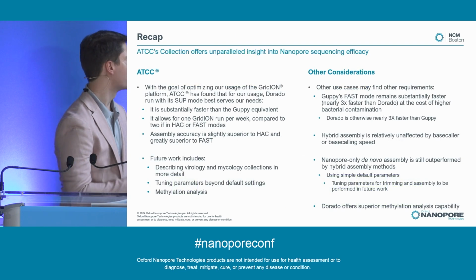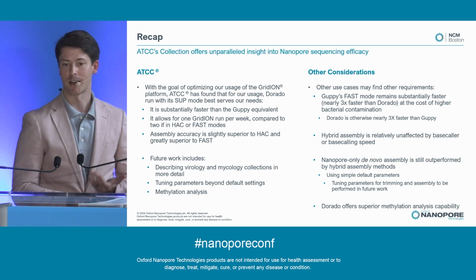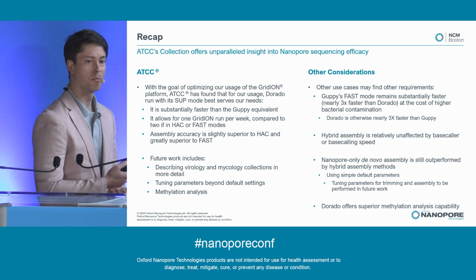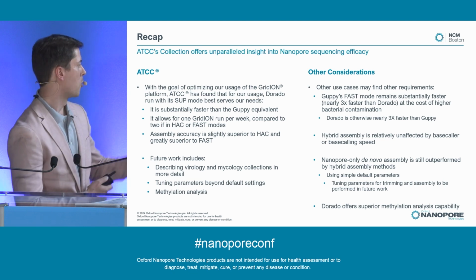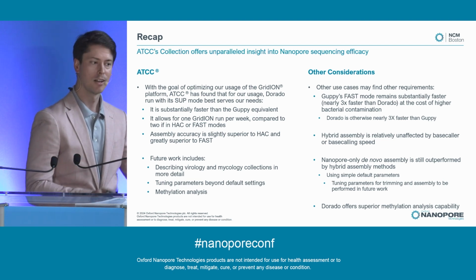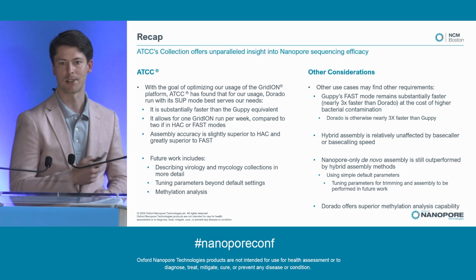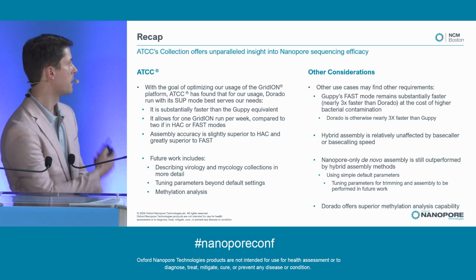It's flashing red at me. But I do want to say that we set out to optimize our use of the GridION, set out to find the evidence that we can make this change. We did just that. We're satisfied with the change from high accuracy to superior accuracy, Guppy to Dorado. More work is coming to show off the virology and the mycology collections, and last but not least, the most significant reason, as we've all heard several times so far, to use Dorado is the enhanced and ever-increasing methylation models that are available to it that are not being supported on Guppy the same way.